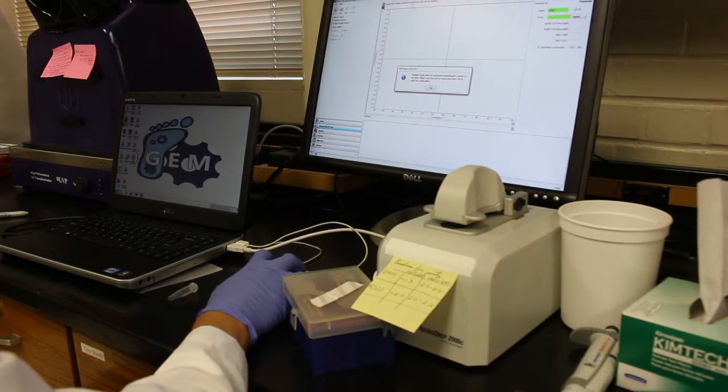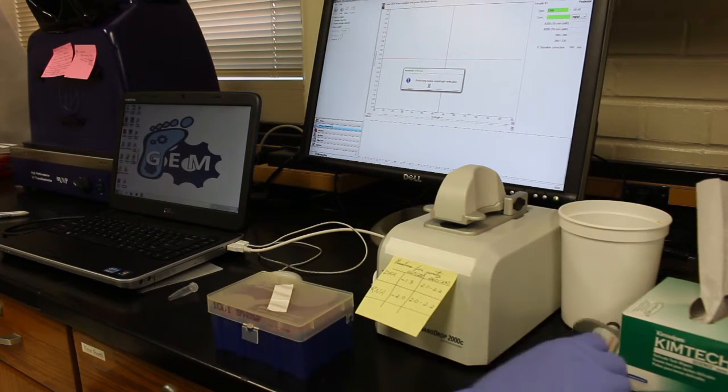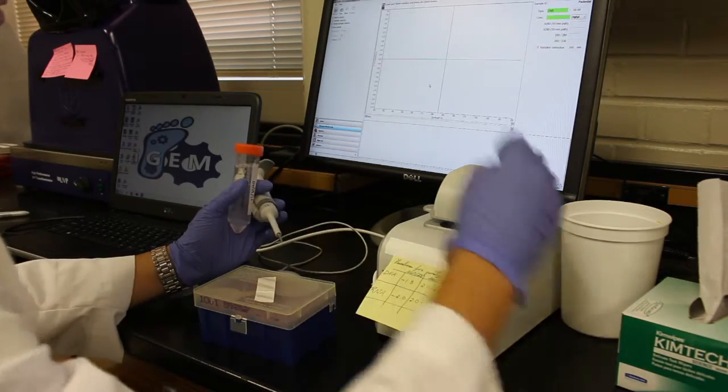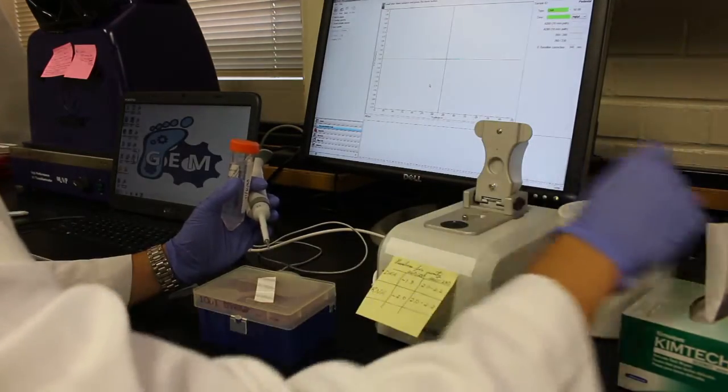The device is used in conjunction with the Nanodrop software on the computer. Open the Nanodrop program and select Nucleic Acid on the home screen. Allow the machine to make its routine wavelength verifications with the arm down, and then load 1 microliter of USP water on the metal tip to blank the machine.